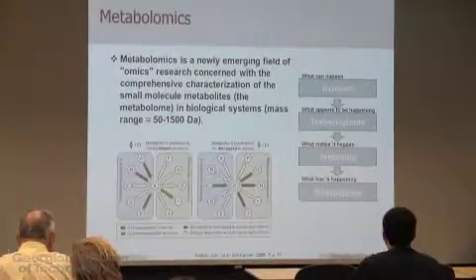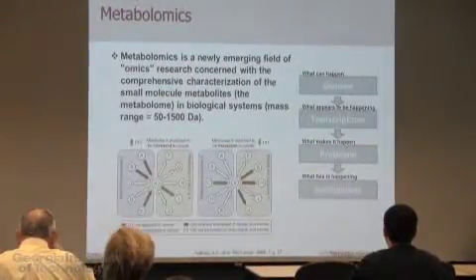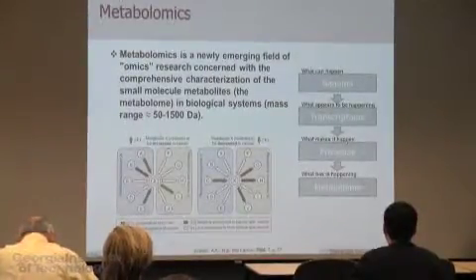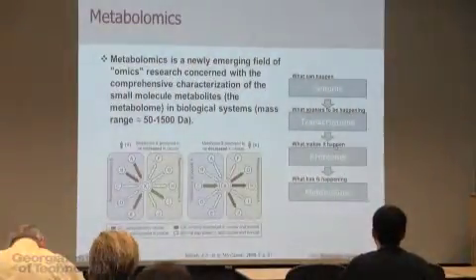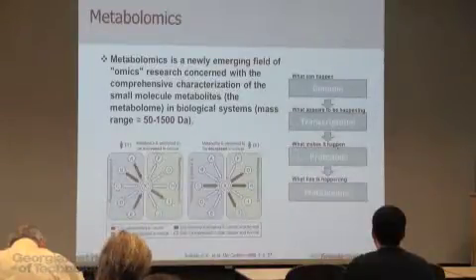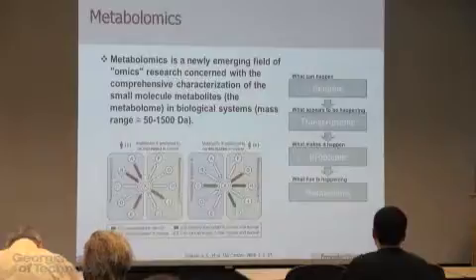But metabolomics, as the name implies, is the system level or network level measurement of metabolites. Some people call metabolomics global metabolomics. I don't like to use the word global, because as you're going to see, we never measure all metabolites known to man. Okay, we never measure that. We cannot measure that all at once yet. Okay, so it would be too ambitious to say that we are doing that, but we're trying to get there. Okay, typically or operationally speaking, we're talking about relatively small molecules in the range of 50 to 1500 Dalton. Okay, so this involves sugars, lipids, amino acids, steroids, you name it.